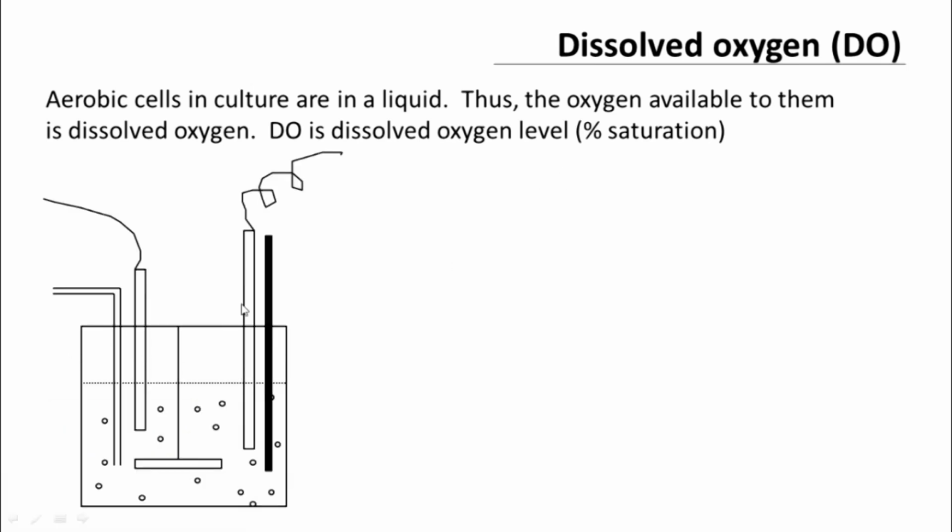So this is the bioreactor here again, the schematic of it: the stirrer as we have seen earlier, the medium in which cells are growing, maybe the DO probe, pH probe, the air inlet, and a temperature probe. Let us choose a conceptual system. Our systems, as you know, could be either real or conceptual. In this case, we are going to choose a conceptual system. Why we are choosing such a system would become a little clearer later. Most likely I will point that out.